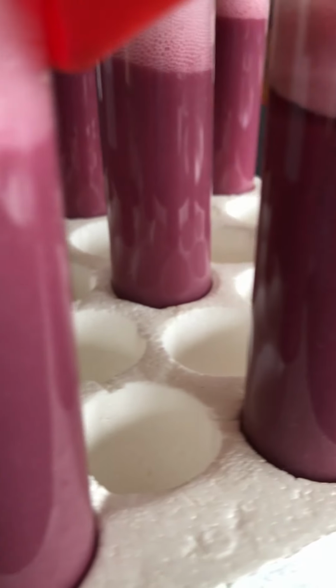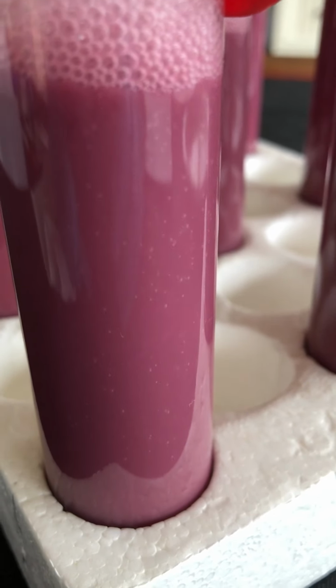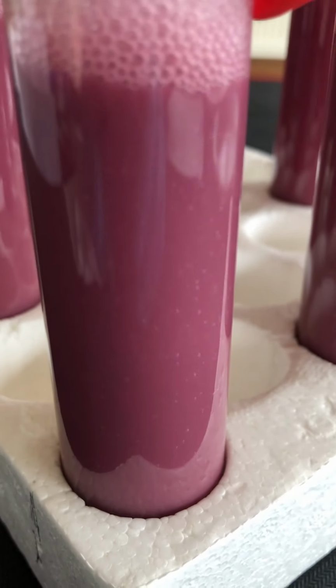So we're going to report back on this, but this is all part of the investigative feel of what we're doing here in the fermentation of sugars by yeast.